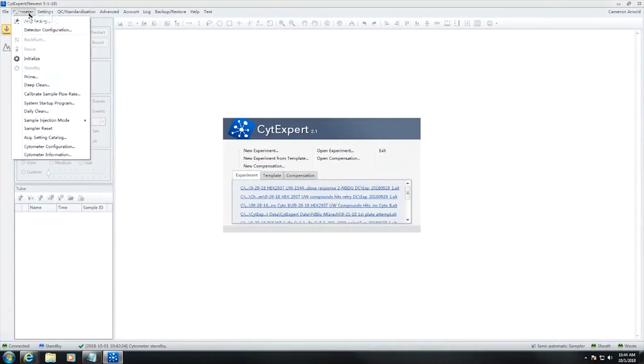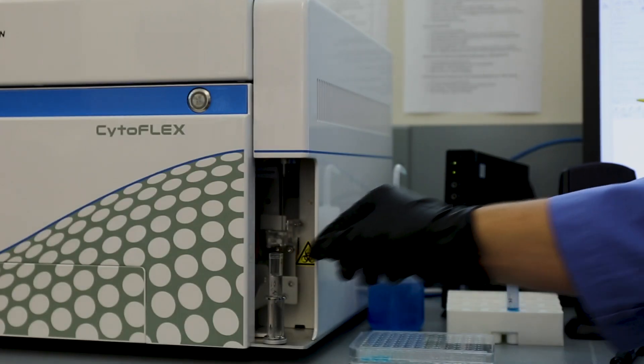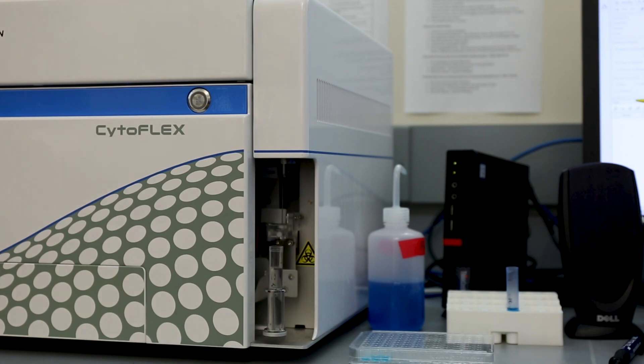Under Cytometer, run System Startup. Follow on-screen instructions. It takes roughly 8 minutes.